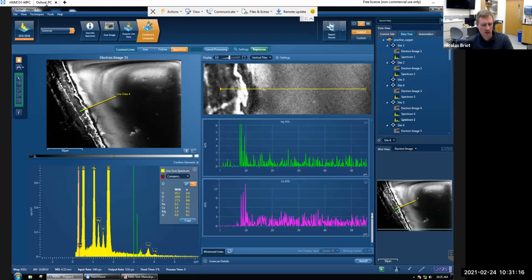I think I saw something when it was directly on the rod, not on the cross section. We have time to vent, put that sample in, and then try it. Maybe we're just not getting the depth that we have in the past with this sample, the depth of the silver into the surface.